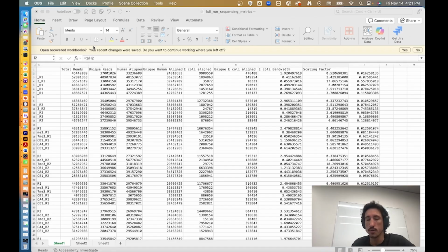And so imagine you're a baker and you're trying to compare how many chocolate chips are in different batches of cookies. However, each batch has a different amount of starting material or dough. The way that a baker can try to assess different numbers of chocolate chips would be to add the same amount of raisins to each batch of cookie dough.